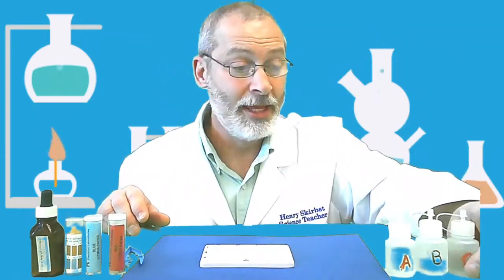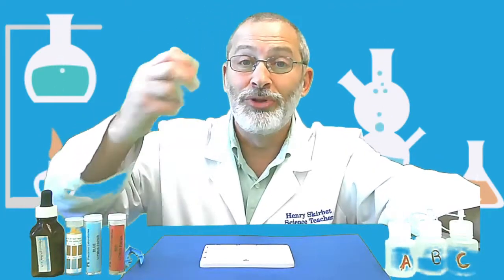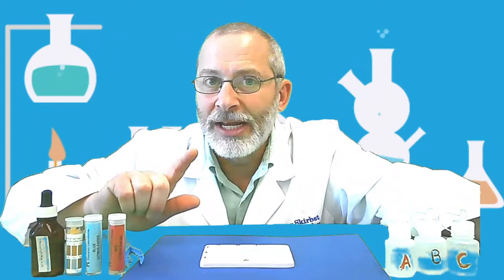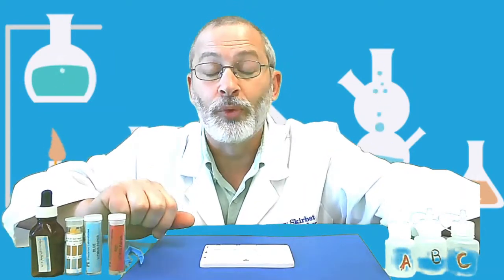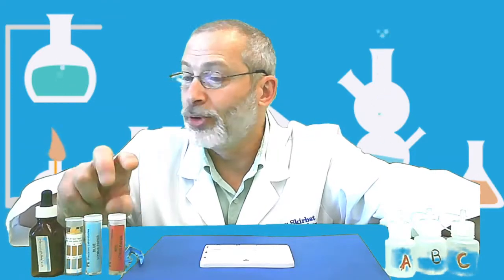Yep, there is a distinctive odor. When you do this in the lab yourself, you'll be able to waft the odors. But I don't want to share those odors with you right now because I want us to perform the 3 tests, beginning with the litmus paper test.